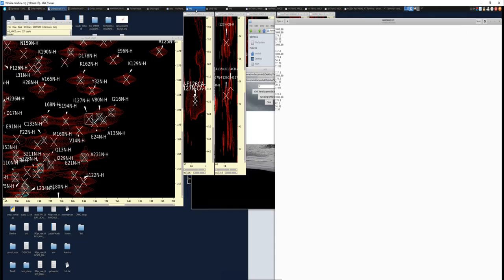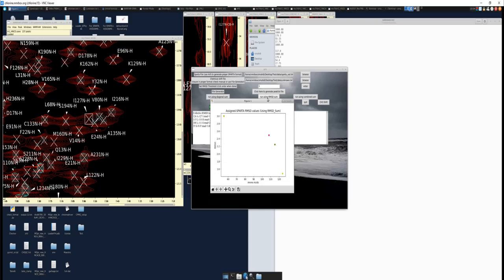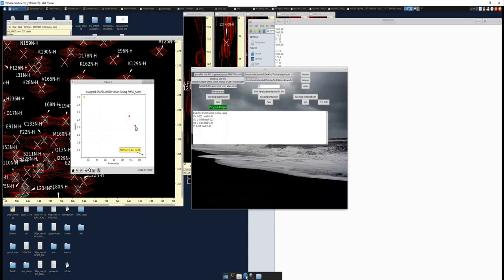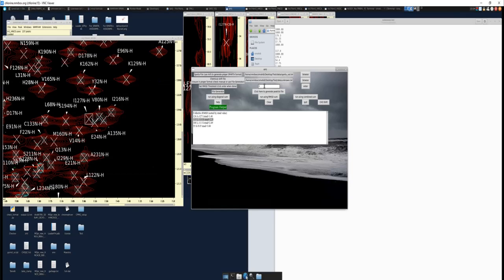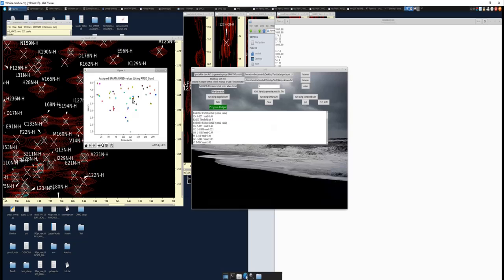So let's save this and, oh, wrong one, sorry. Clear this and run it again. Now you can see that this distinction and deviation is even more. We've gone from, I think, the previous five or six matches to only four. The difference between the two is even larger. In fact, if I change this to five, you can see from the plot at least how obvious your match can be. It's quite clear from all of these amino acids. There is one that matches far better than all the others.